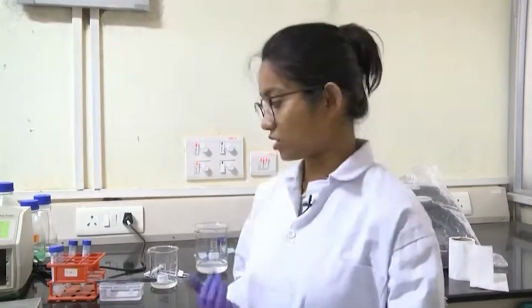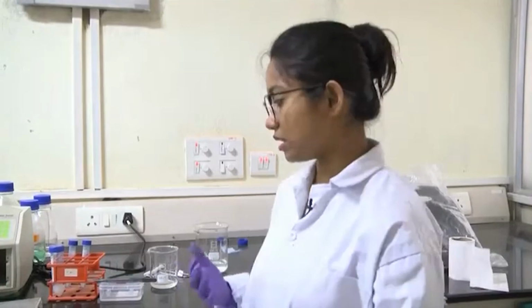Now it is a very useful technique, and it is qualitative as well as semi-quantitative. If you have different samples, you can get the relative amount of the protein present in each sample. If you have an unknown sample and you do not know whether a particular protein is present or not, you can detect that protein with this Western blot technique, and it will also give the molecular weight as well as the amount in a particular tissue sample. So the Western blot technique is used in molecular biology labs, mostly protein labs, on a day-to-day basis, because it is a very good technique and it is very sensitive as well. So if you want to detect any particular protein, you can detect that.